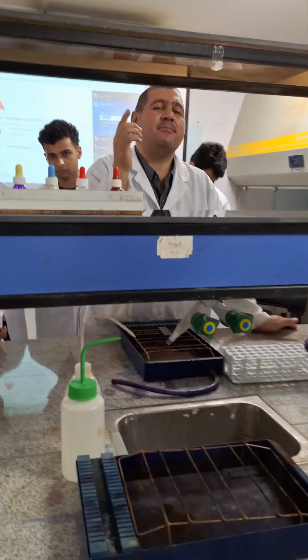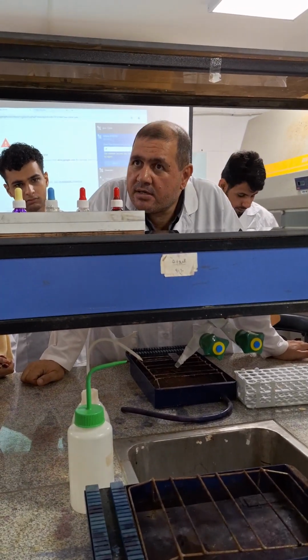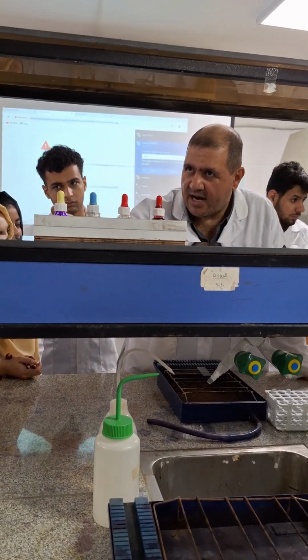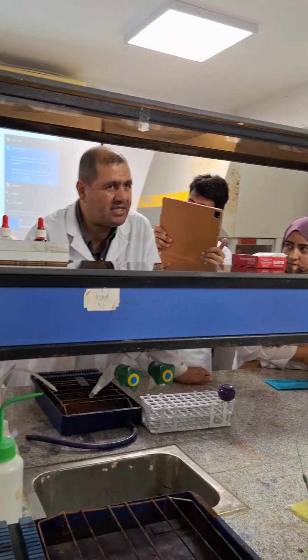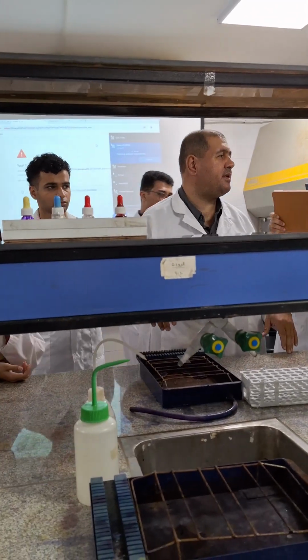In simple staining, after staining, you can see shape, size, and the arrangement of bacteria. In differential staining, for example, in gram staining, in addition to shape, size, and arrangement, we can distinguish gram positive from gram negative.